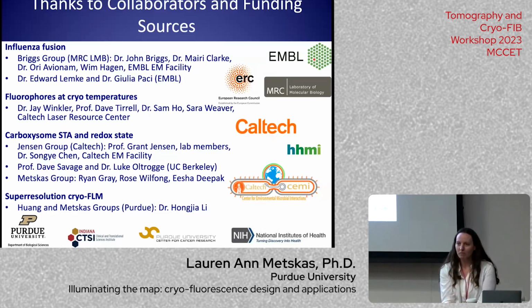Excellent talk. I have several questions, so maybe I'll catch you offline to ask all of them. But one high-level question is, since you're interested so much in methods development, is your lab or really anyone in the room attempting to collaborate with maybe Janelia Farm or even Thermo Fisher to develop fluorophores that are less temperature sensitive in cryo conditions? Yeah, so it's a great question. We were briefly partnering with Delmic. The collaboration didn't get off the ground, but just to characterize the fluorophores that are currently available, because developing new fluorophores is great, but especially for people who design fusion proteins inside complex systems, we really don't want to have to tell them, oh, by the way, I know it took you 2 years to label this, but you've got to go back and do something else and then do all the controls again.